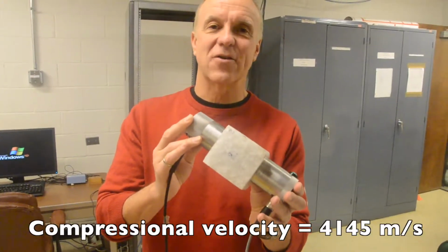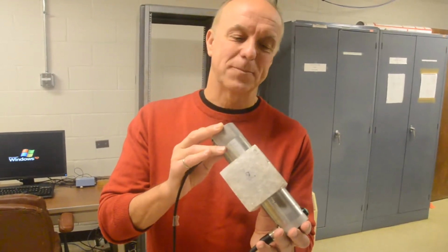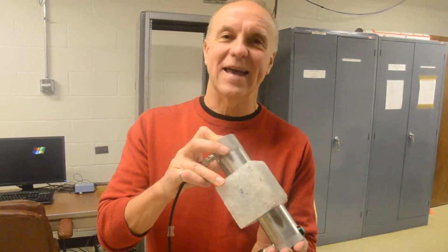Now we have a number that describes a salt, and we can use that for exploration and many different purposes. That's it for salt and salt's velocity.